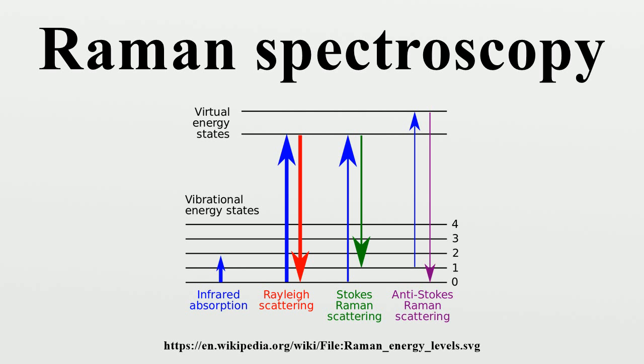However, modern instrumentation almost universally employs notch or edge filters for laser rejection in spectrographs, either axial transmissive, Czerny-Turner monochromator, or FT, and CCD detectors. There are a number of advanced types of Raman spectroscopy, including surface-enhanced Raman, resonance Raman, tip-enhanced Raman, polarized Raman, stimulated Raman, transmission Raman, spatially offset Raman, and hyper-Raman.